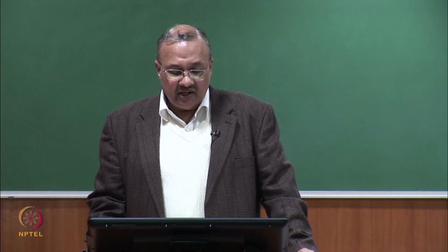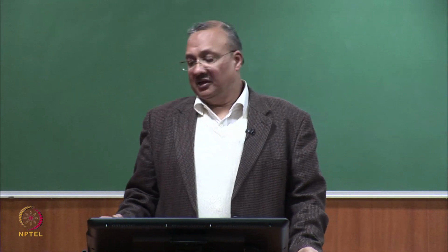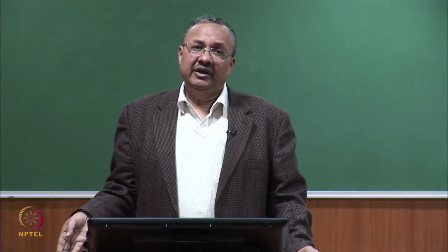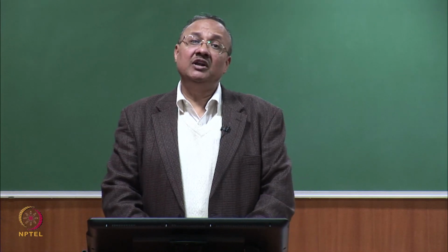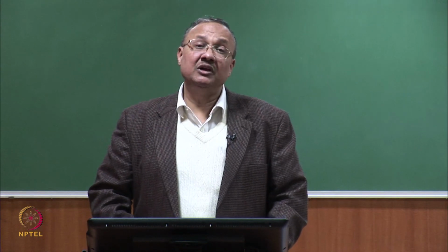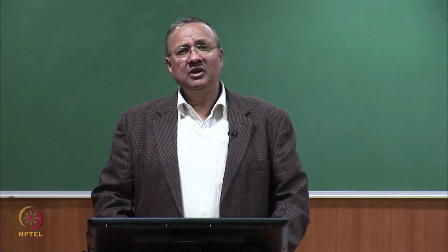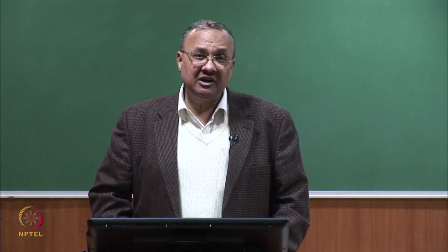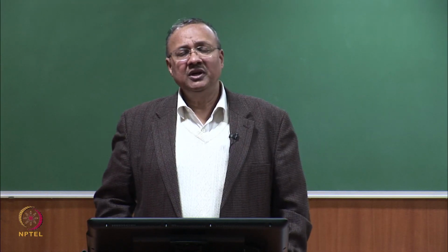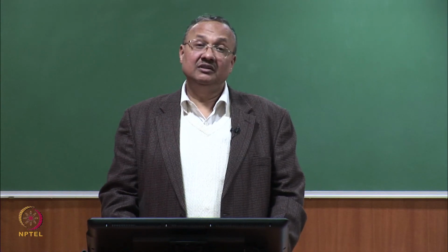So, with this I come to the end of my lecture on EDS combined with SEM. For EDS we have to have an electron gun source, so it cannot be done independently, it has to be combined with an instrument, and especially in SEM it is very useful. In TEM, transmission electron microscopy, it can be used in a similar manner, but that we are not covering because that is not part of our syllabus in this module.